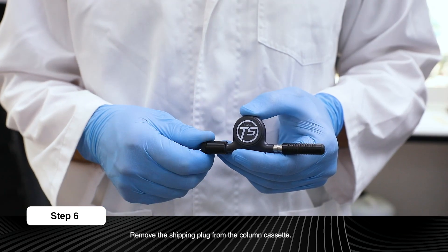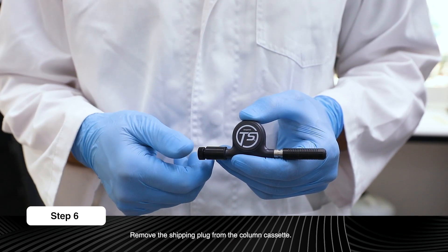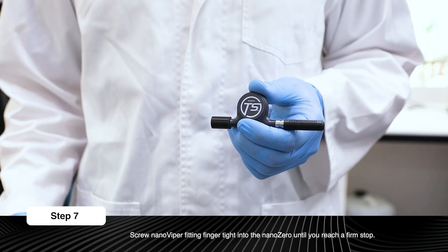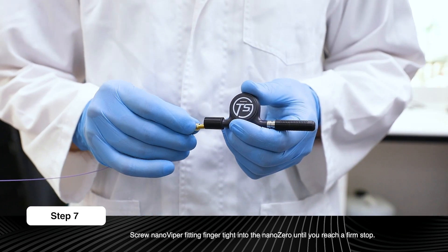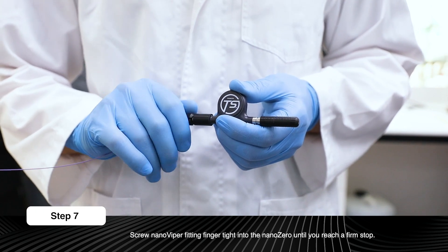Remove the shipping plug from the column cassette. Remove the column cassette firmly, and screw a Nano Viper fitting finger tight into the Nano Zero until you reach a firm stop.